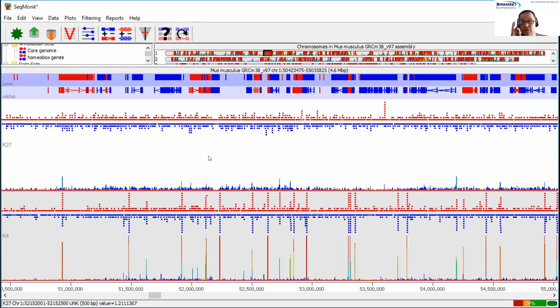In a graphical environment such as SeqMonk, one of the problems is keeping track of what you've done. We obviously recognize that this is a problem. We want to do reproducible research. We want to be able to track what we've done and report exactly what we did so that we can do it again. And SeqMonk does this. Up on the toolbar at the top, there is a button that launches what's called a history. Now, I think this might be one of these windows that disappears. So I'm going to quickly switch across and show you the history window that opens up.